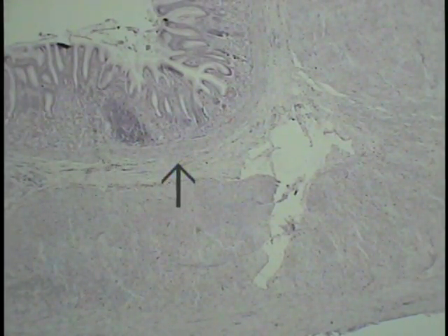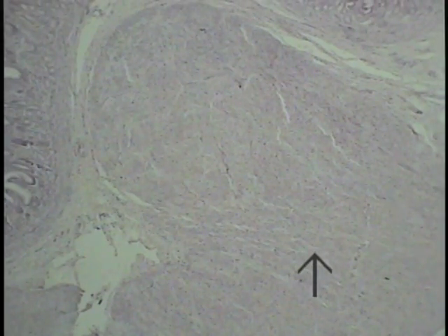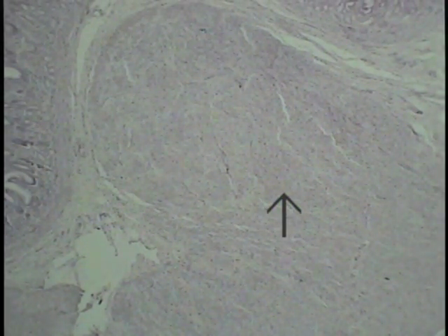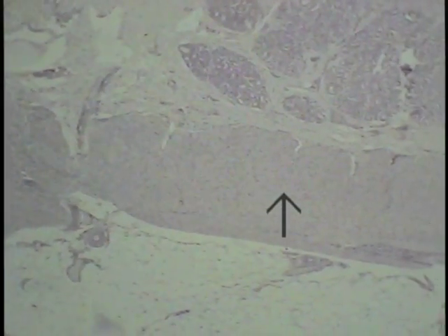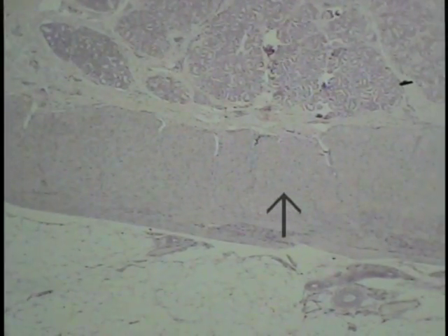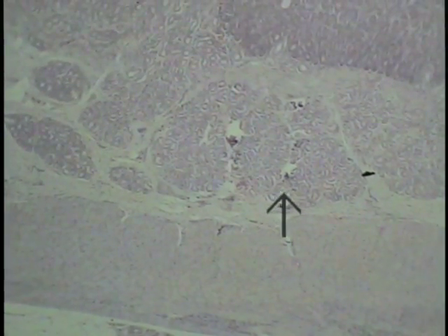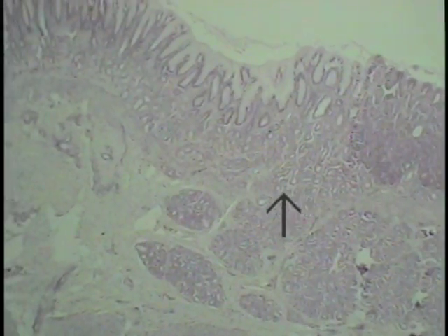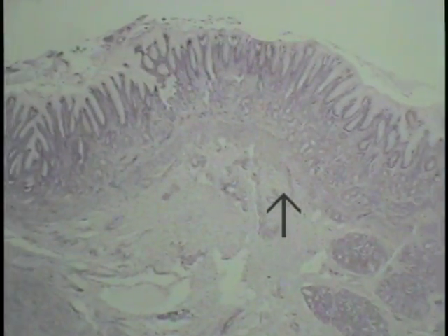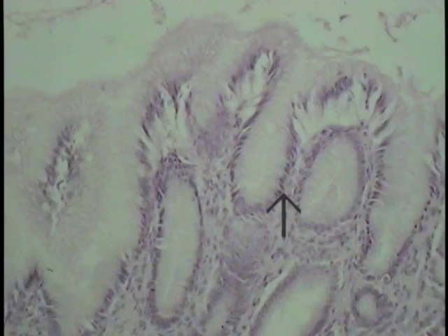So here's the mucosa, this is muscularis externa, the arrow's on the inner circular layer, it's the one that balloons up, forms this sphincter type area, and then will reconstitute itself as the spiral of the inner circular layer as we go down the intestinal tract. So these are the features of the gastrointestinal junction as seen with the low-power scanning objective.